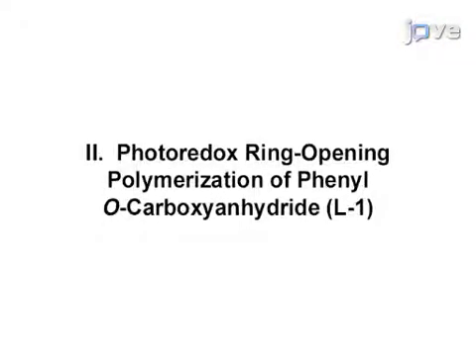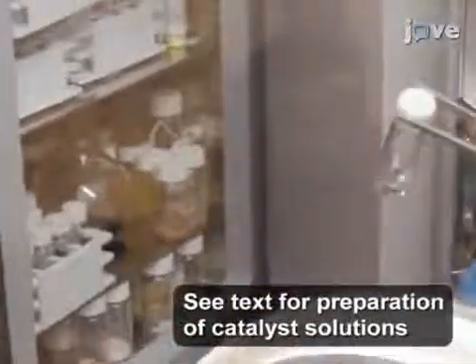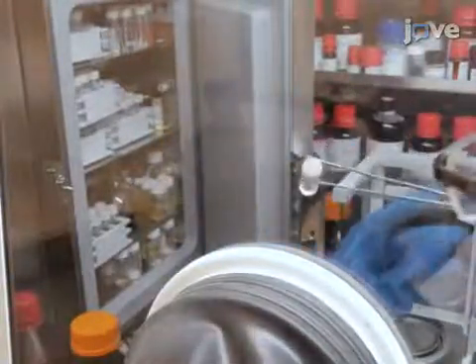Demonstrating the procedure will be Quan You Feng, a postdoc from my laboratory. To begin the procedure, prepare solutions of Bipy-Nickel-COD, Zinc-Bis-HMDS, benzyl alcohol, and the iridium catalyst in anhydrous THF. Store the solutions at minus 35 degrees Celsius.